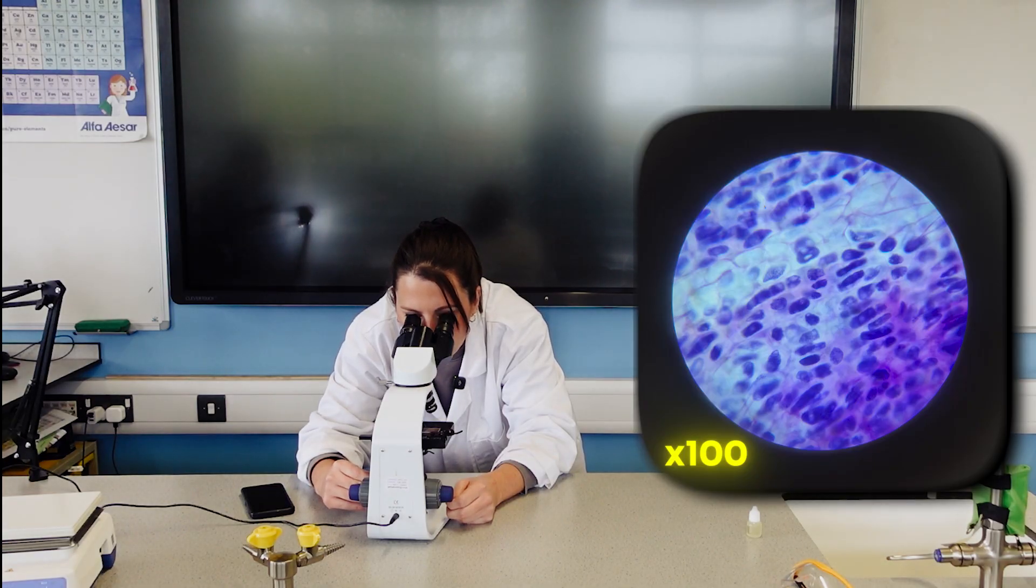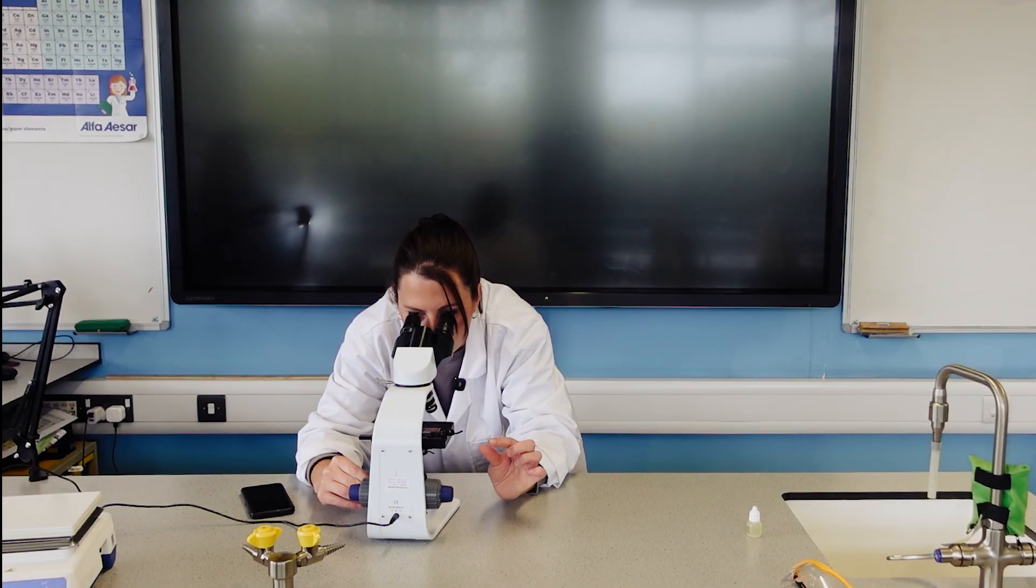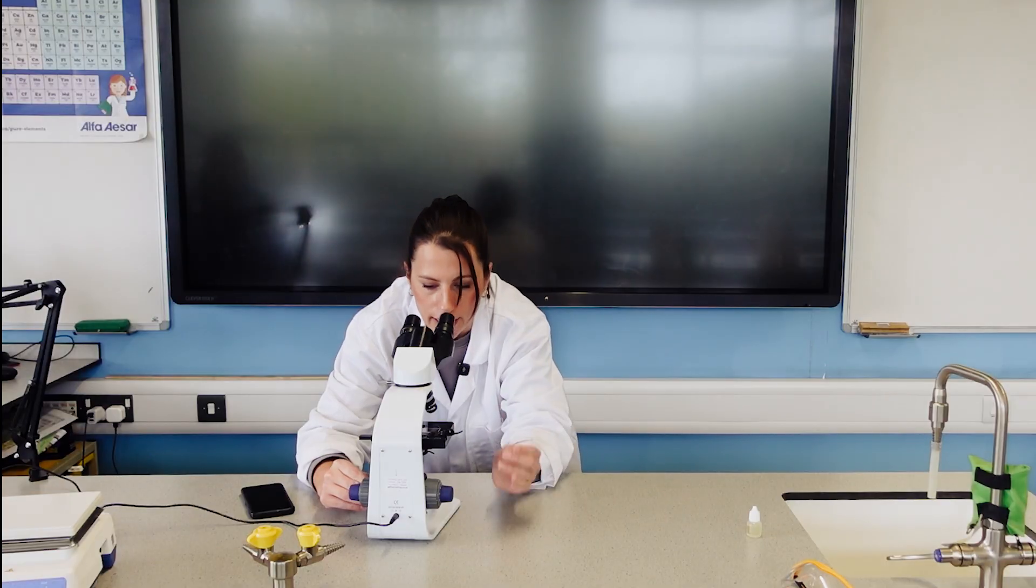Just move along their slide and try and find a field of view that has any cells undergoing mitosis. So that's what I'm currently doing. There's some that look like they might be in telophase, which I'll show you.